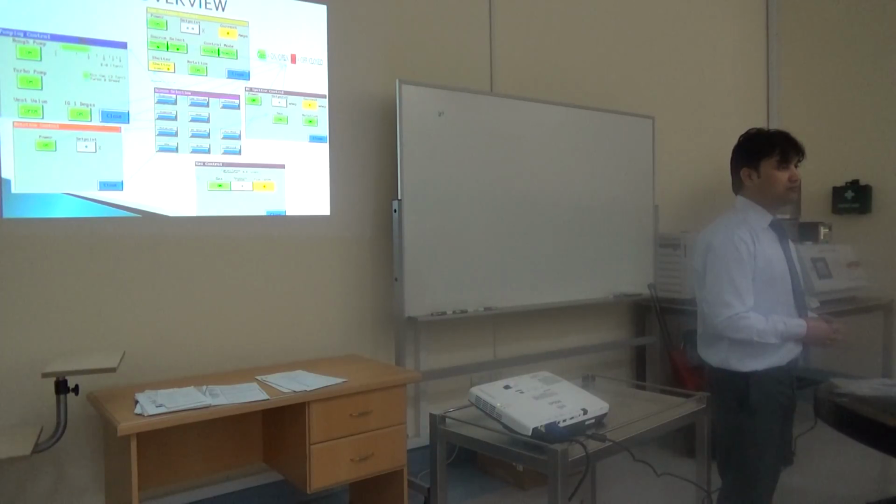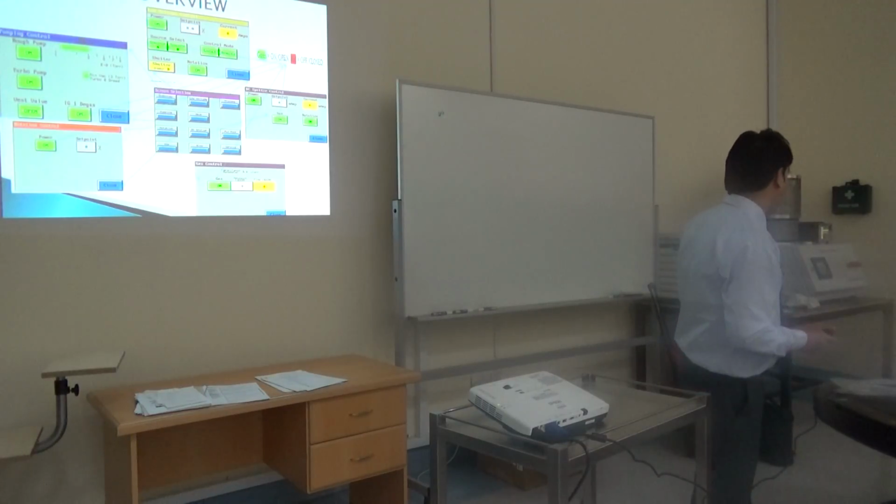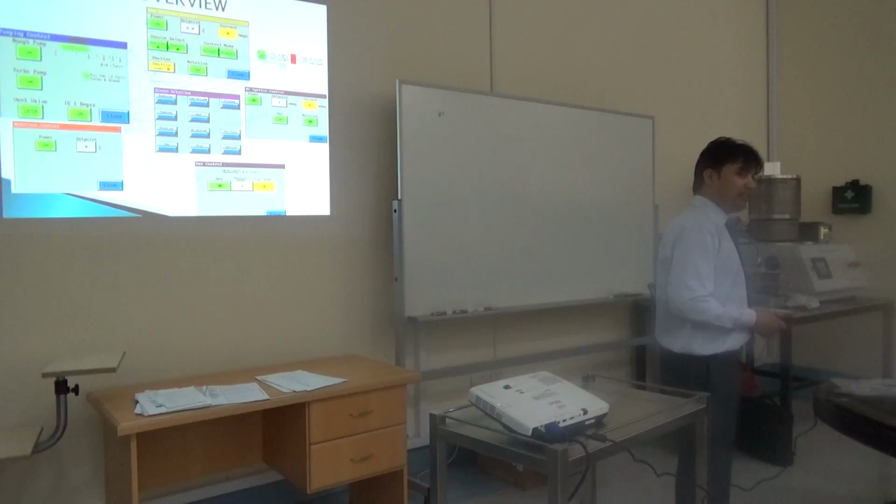Nitrogen is supplied from the gas inlet, if you want to use nitrogen. In the back side, there is one point where you have to apply the nitrogen. And you have to maintain the nitrogen pressure at 80 to 100 psi.